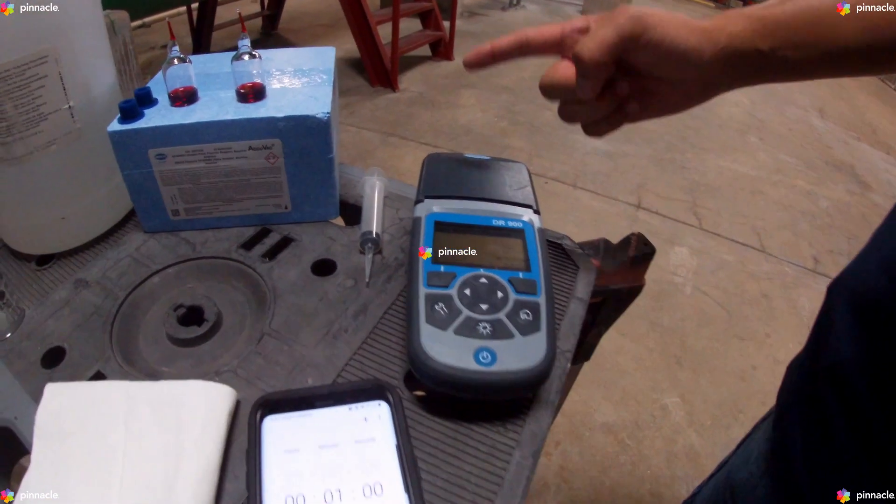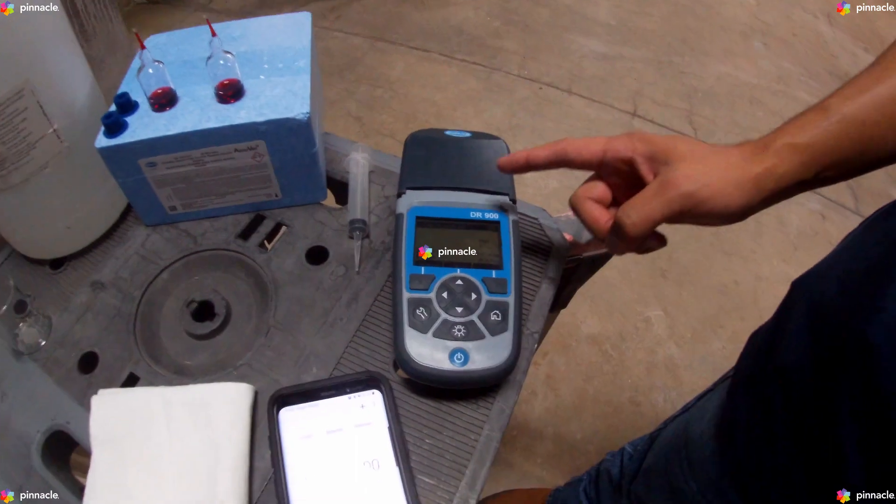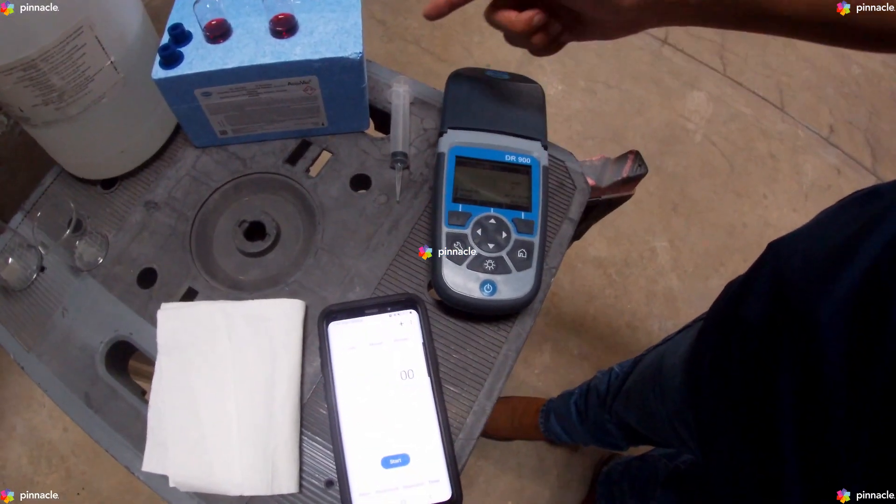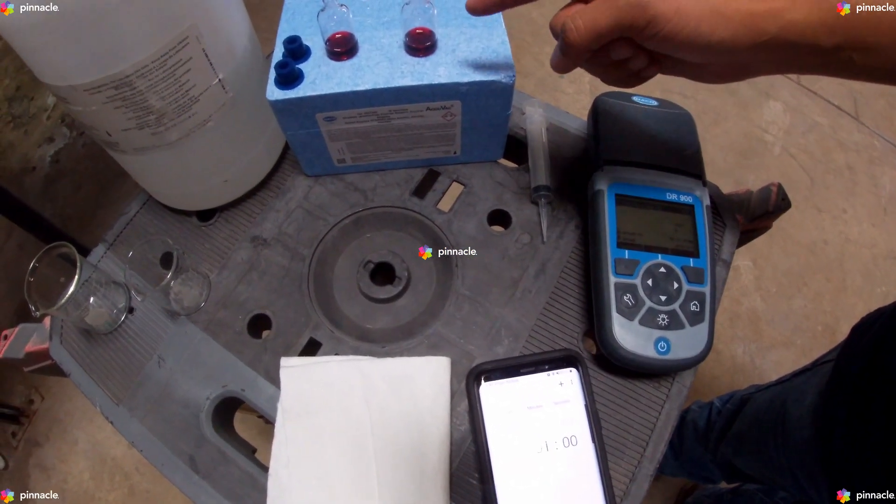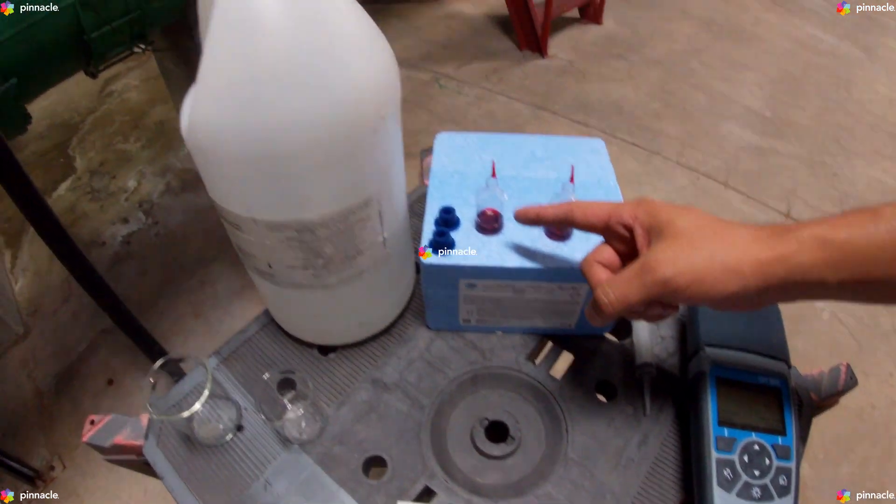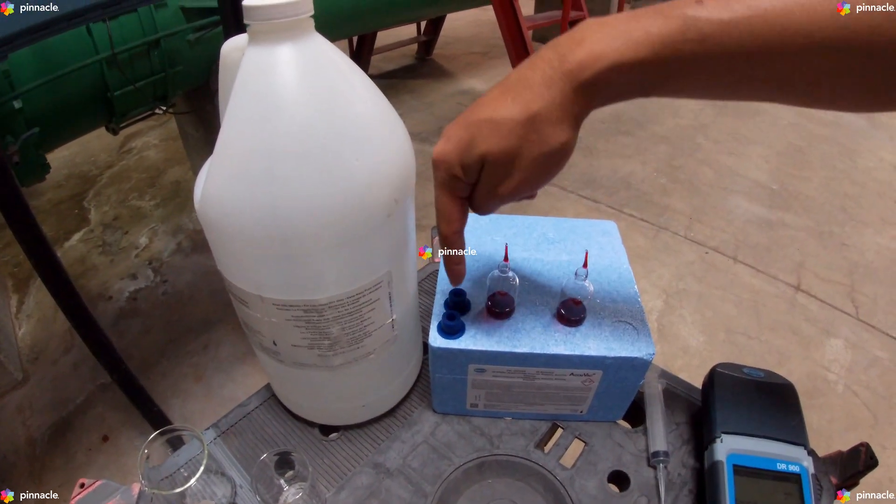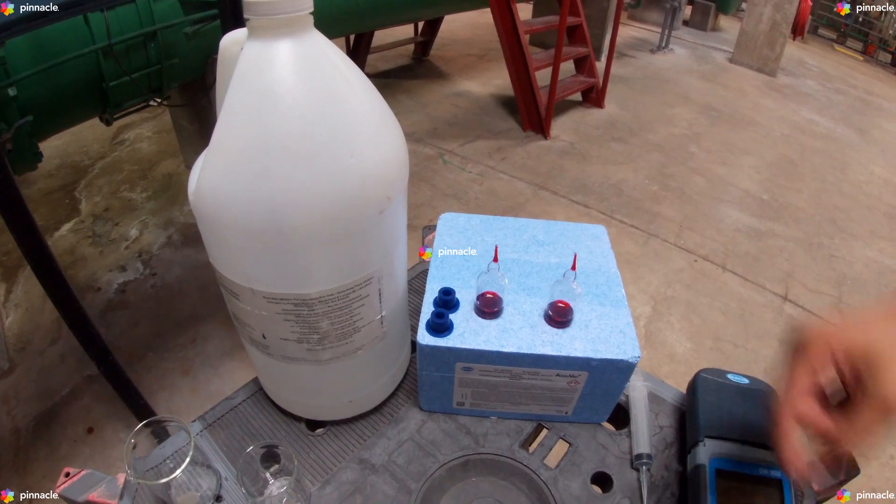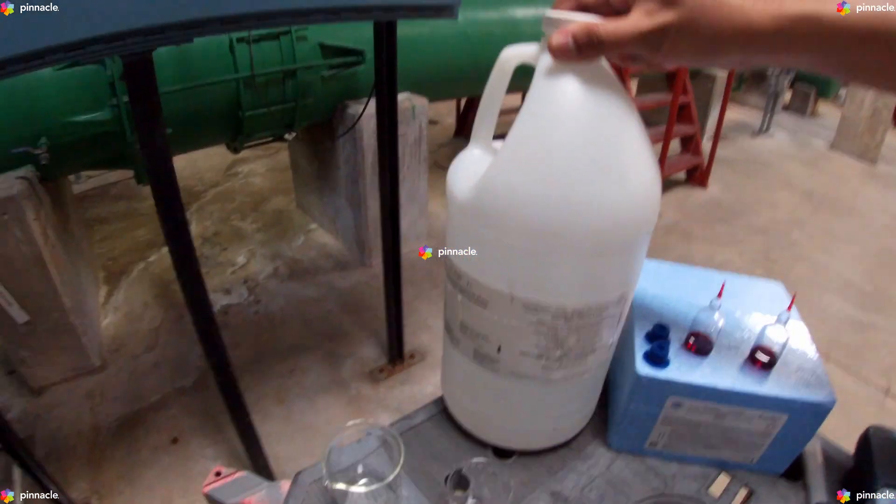For our verification we will be using our DR900 pocket colorimeter, a syringe, two AccuVac ampules, two caps, and RDI water.